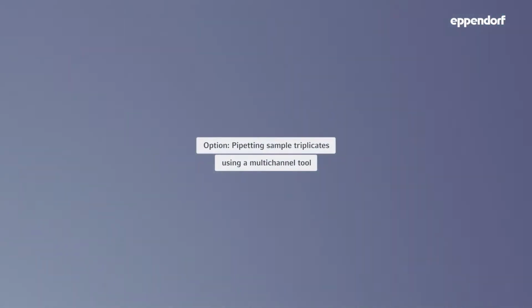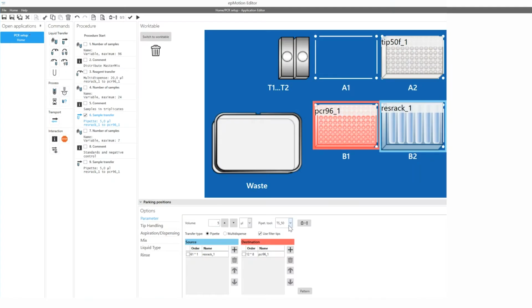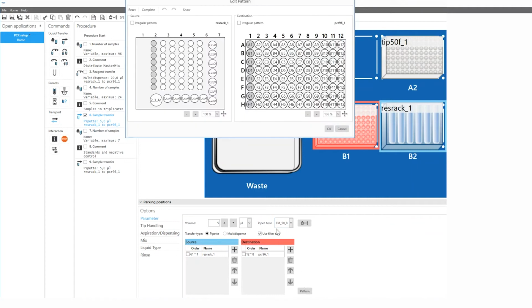If the samples can be accessed by an 8-channel tool, you can speed up the sample pipetting. The previously set procedure can be quickly adapted by changing the selected pipette tool and adapting the pipetting pattern.